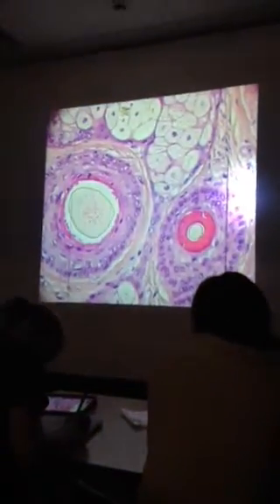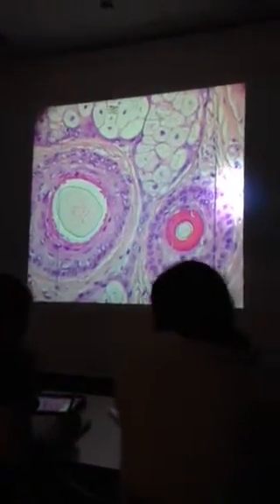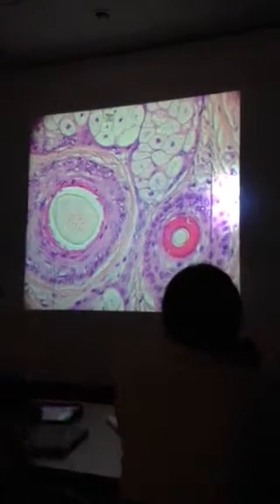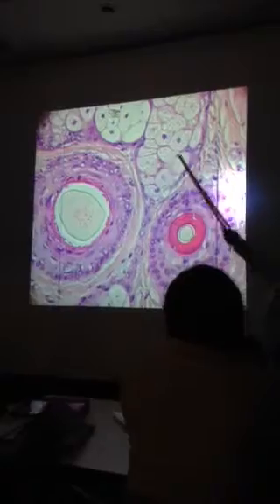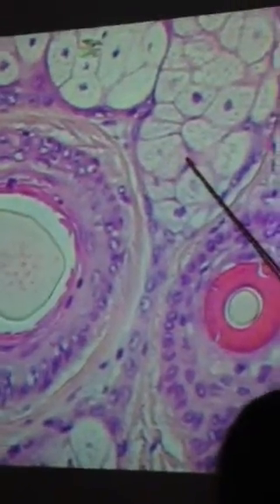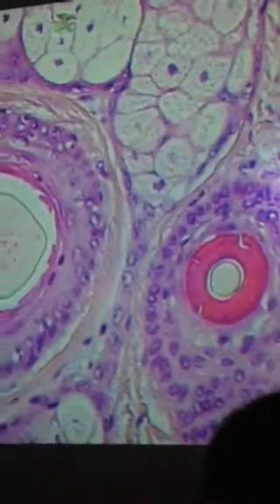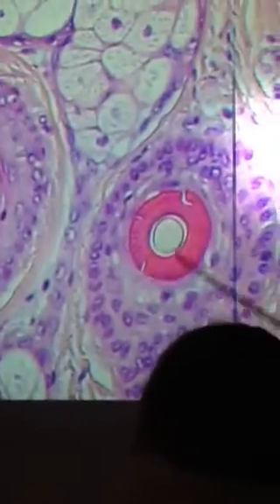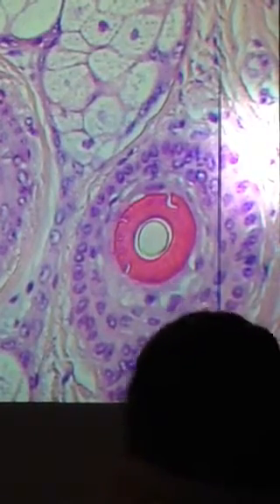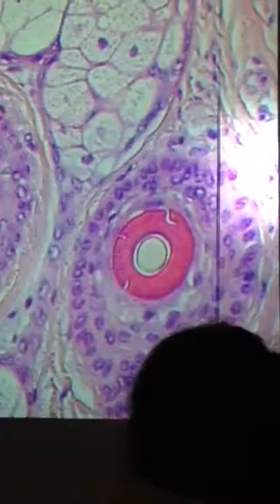All right, what are we looking at? Another pre-test thing that many people missed. This is a hair follicle. But what's this thing right here? How many of you drew a hair follicle with a sebaceous gland? Okay, so again, go back. This one actually has a hair in it, okay? This one's just developing a hair. There's a glassy layer, a hyaline layer. There's different layers, but don't worry about that. Just recognize it as a hair follicle with sebaceous gland.